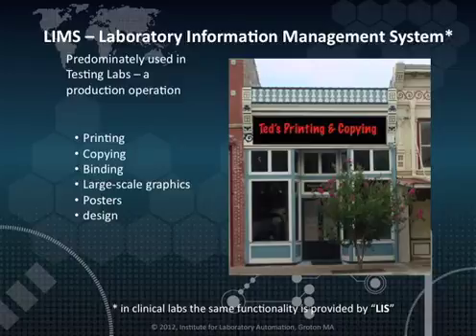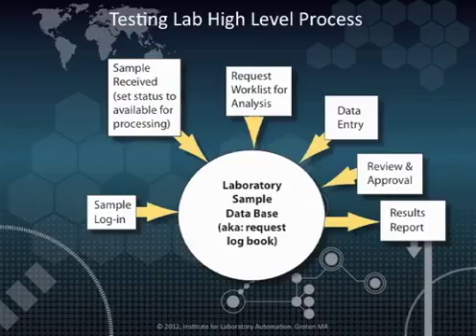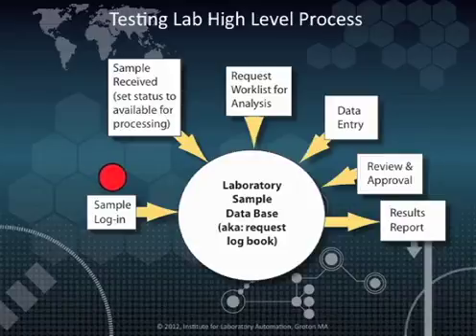In addition to managing workflow, LIMS contain all of the test results for the work the laboratory has done. Just as a customer management system is the operational hub of a printing operation, a LIMS is the hub of a testing laboratory's operations. The LIMS database is the place where information about samples coming to the laboratory are logged, and the sample's receiving status is noted.